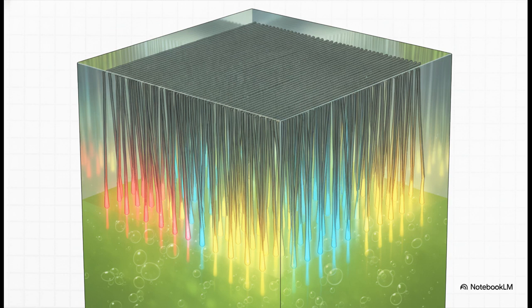By immersing this multi-wire block into a highly corrosive Evans solution, they were able to map local galvanic currents and measure the distinct potential of each individual wire over hours of exposure to perfectly pinpoint metastable pit growth.